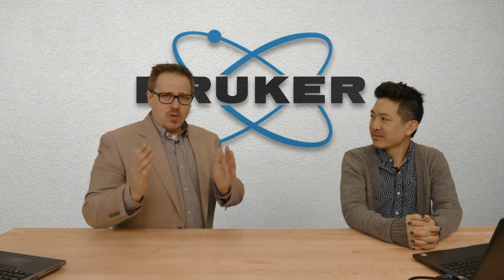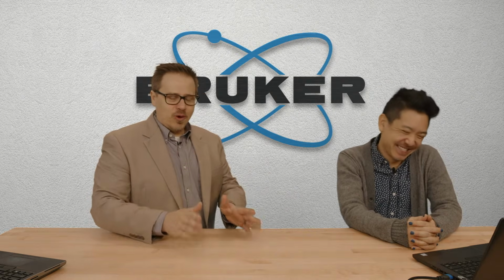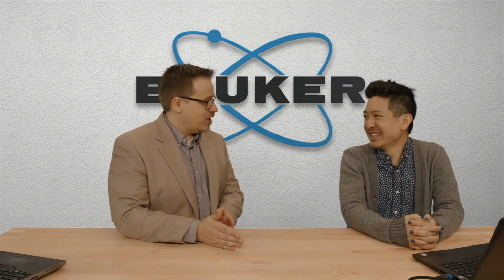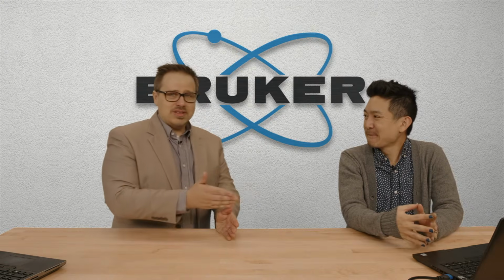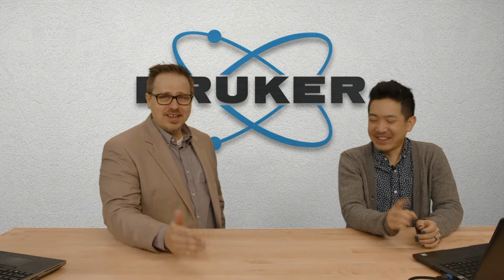So what we would do is, I really didn't care what the individual things were. All I cared about was, are we doing Monday on Monday, or do we all of a sudden have Tuesday on Monday? So we would use a database like this, and I literally went in there, measured pristine samples of each, and I said, this is a Monday. Tuesday, Wednesday. This feels like a Monday.